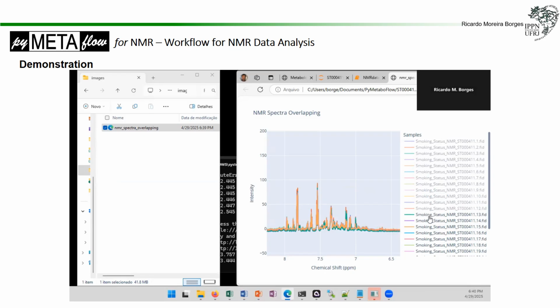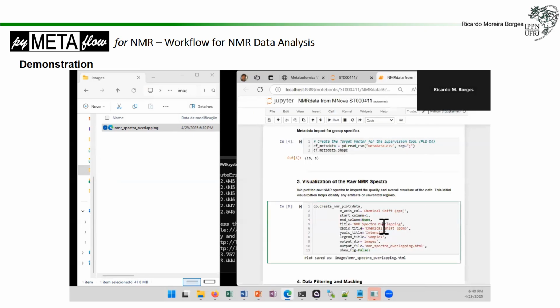Let me show you, let's make it easier to check something. Sometimes you have a standard in there as well, so you want to leave just the standard, or you can compare. You want to compare just some specific data sets. Anyway, you can do that.